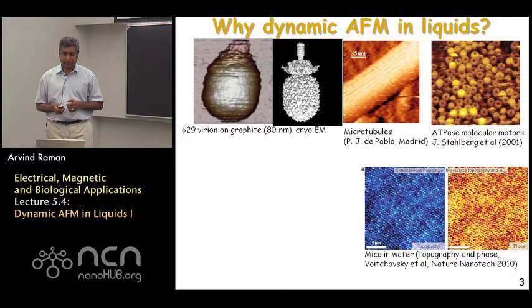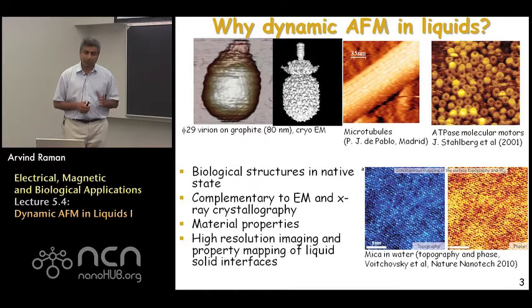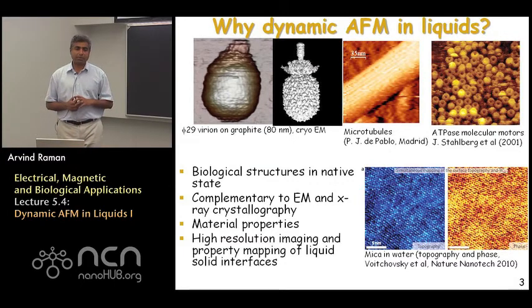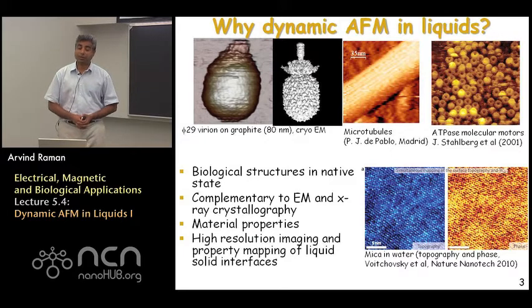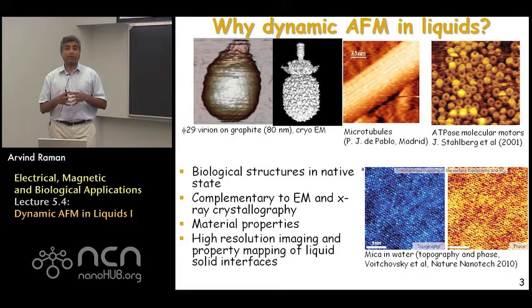It's a good question to ask. Why would you rather put an atomic force microscope in liquid or aqueous environments? The reasons for that are many, and what you see on the top, for example, is a very important growth area of atomic force microscopy, which is the use of AFM for understanding biological samples. Biological samples, whether it's proteins, DNA, or more complex macromolecular assemblies, such as viruses or subcellular components or protein motors, when you start looking at all these, it's very clear that their functioning in a real biological setting, their shapes, really depend a lot on the presence of water.